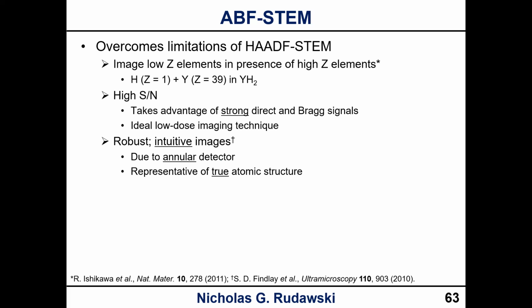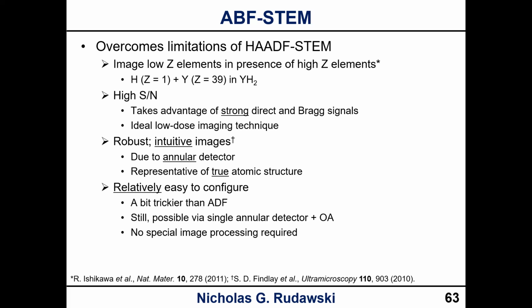We do have robust, intuitive images. The reason behind this is, again, because it is annular in nature. If you want a deep dive into the physics behind it, you can look at this great paper by Findlay in Ultramicroscopy, and he delves into the whole thing. Again, this is fairly easy to configure. It's a little bit trickier than ADF, but still possible to do if you have a single annular detector with an objective aperture, and we don't have to do any type of special image processing either.